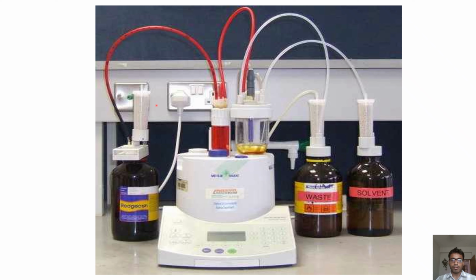This shows the overall picture of your machine. It's too small actually. You can see the reagent bottles, the waste, the solvents, the reagents, the KFR. Here the overall reaction takes place. We need to put our sample, the powder or granules, in that location.